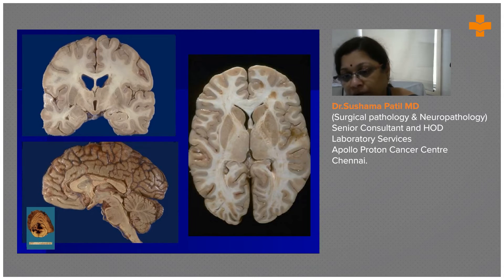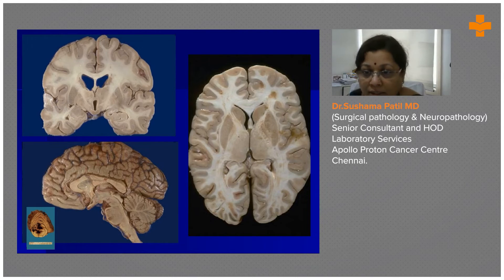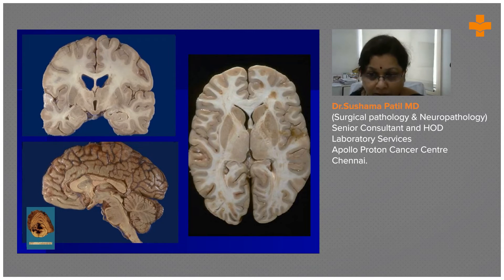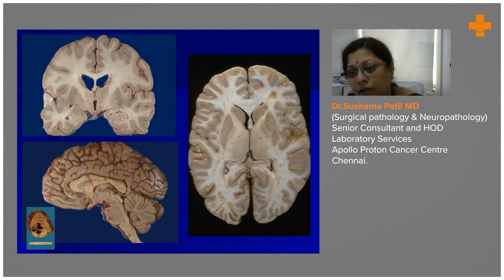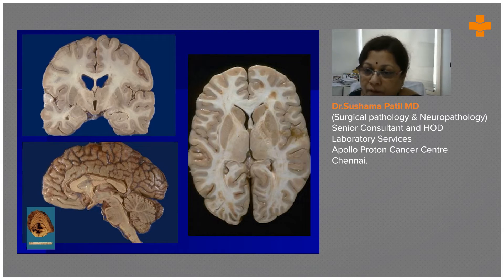Here are the two thalami and the pineal recess. See how structures look different when viewed in different planes — axially it looks different, the location seems different, and in the sagittal plane it looks different again. In the sagittal plane you see the pineal recess here, whereas in the axial plane you see it here. The temporal lobe is here, and the Sylvian fissure doesn't come into picture because we are going top to bottom. You can see slit-like ventricles here.